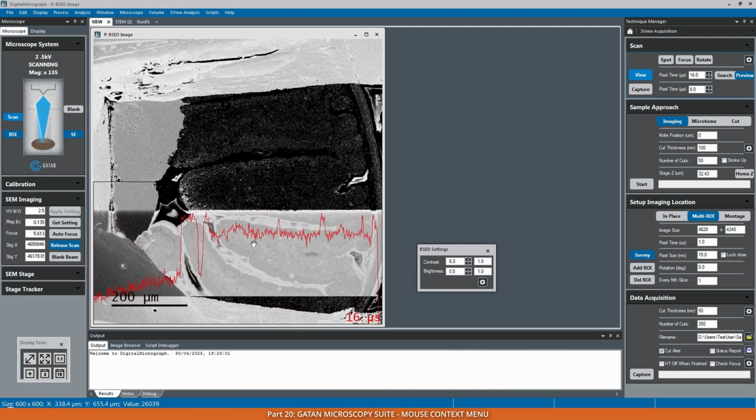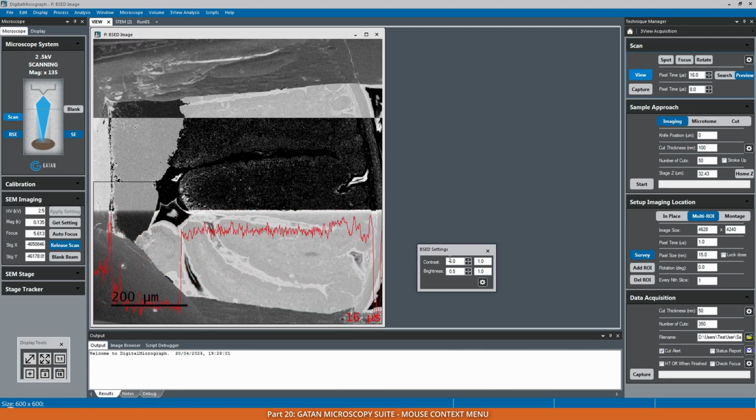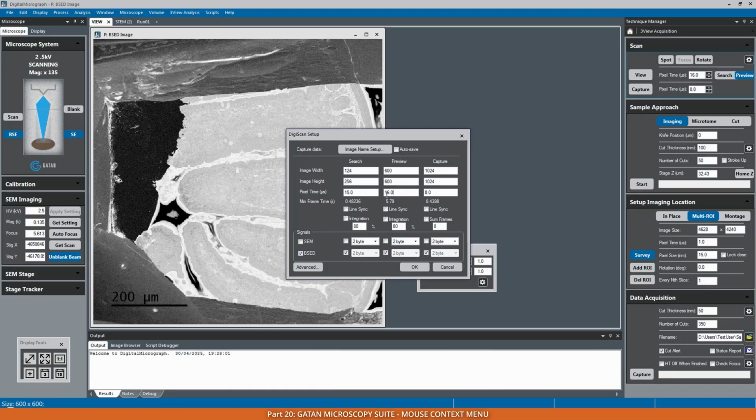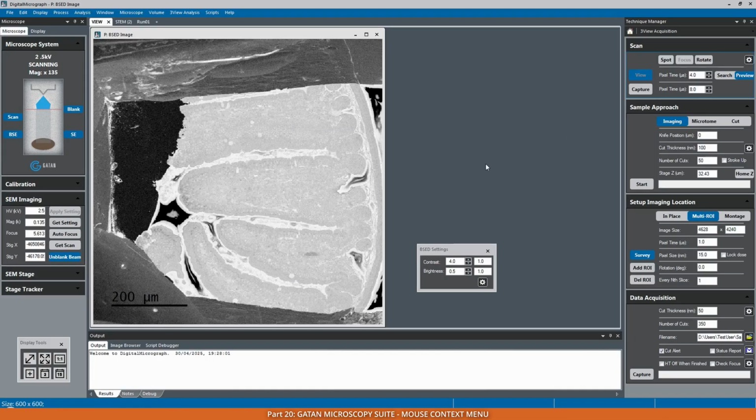But basically, what you can do, you can use this line and use these backscatter detectors, which are available from this menu. Right-click over BSE, so that you can tweak the parameters. Then I go back here and put back my 4. Start the view.